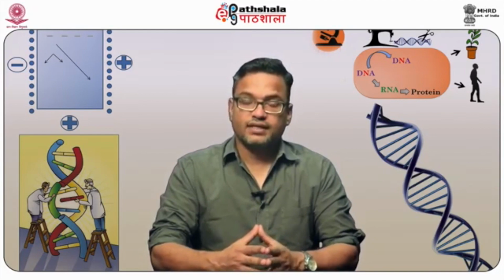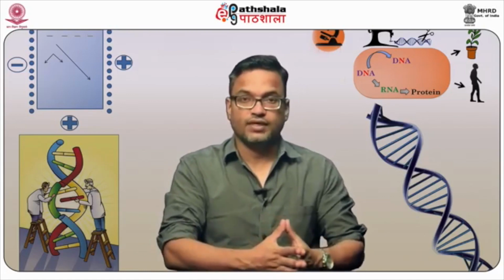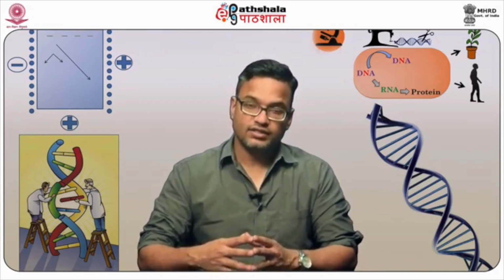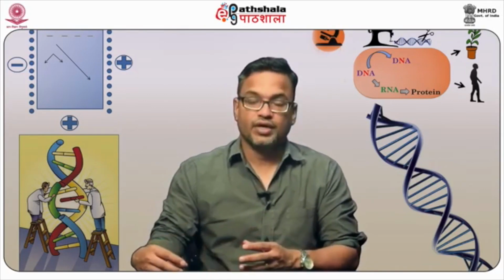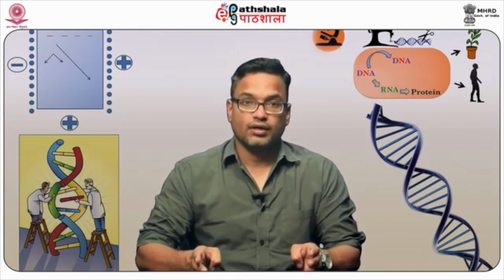It remains there and then it comes back to its ground state as the energy is removed. It has absorbed the energy. Now it is coming back, and what happens in this case is that you have loss of energy, which results in a higher or longer wavelength. This entire reaction is very fast, I beg your pardon, it's very fast, and you again see a signal coming out. So the difference between the place the wavelength has moved is also called Stokes shift.